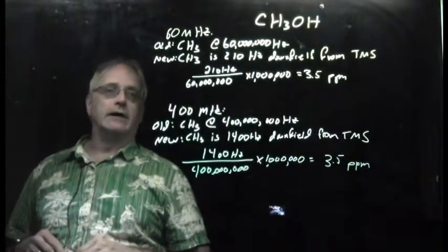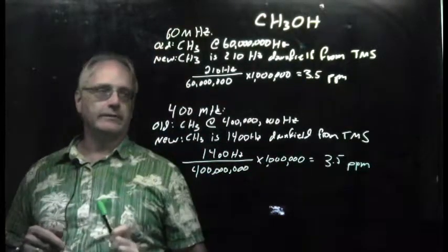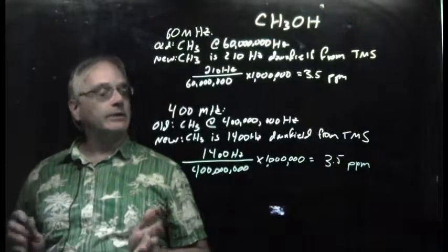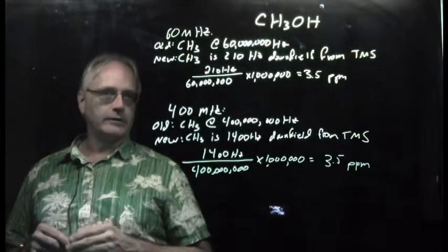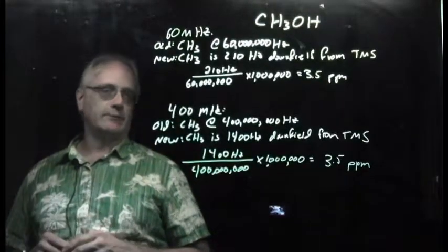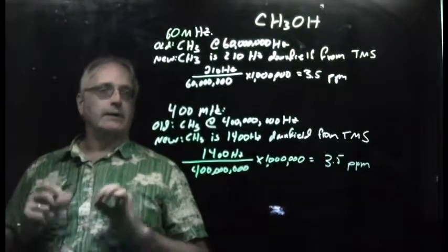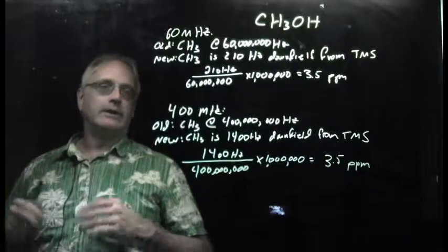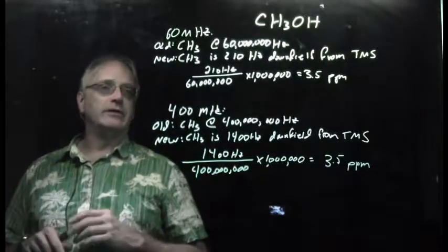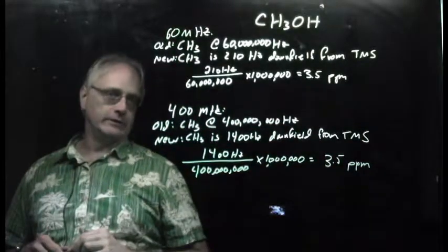And that is how NMR spectroscopists with old, smaller magnets, mid-sized magnets, or even the newer, most powerful magnets available, can report chemical shifts of any of the compounds we study and report the exact same value. That's because we don't report absolute frequencies, we report parts per million frequencies related to the base frequencies of the instruments we use. Let's consider this now.